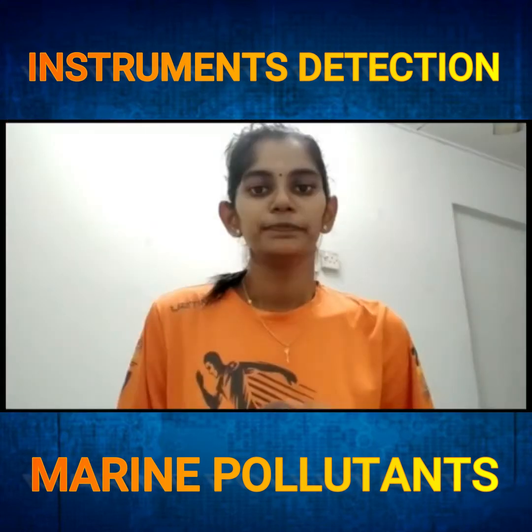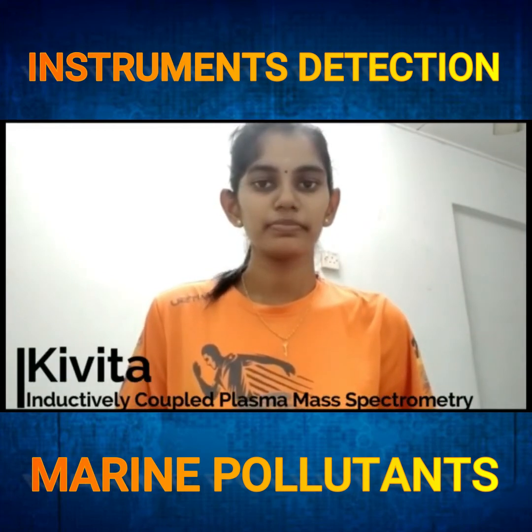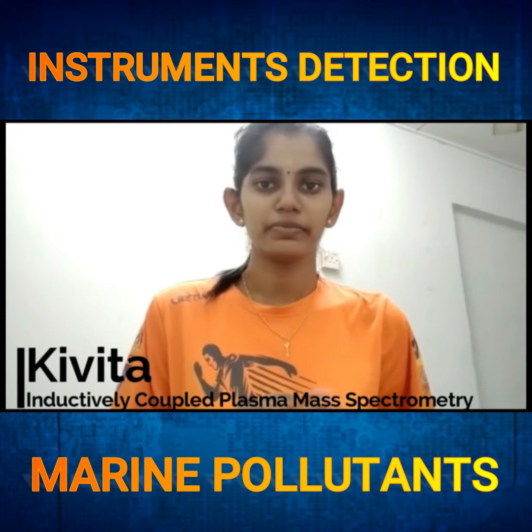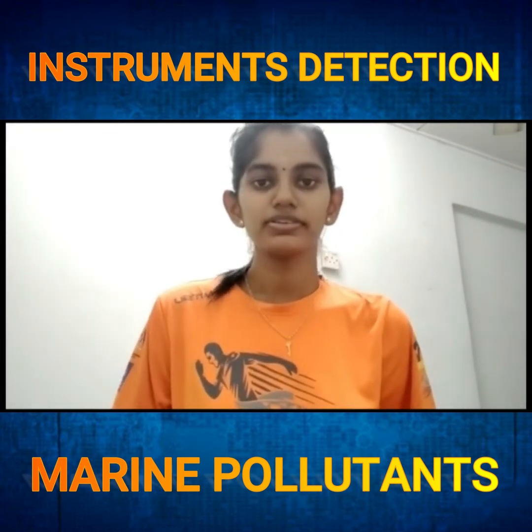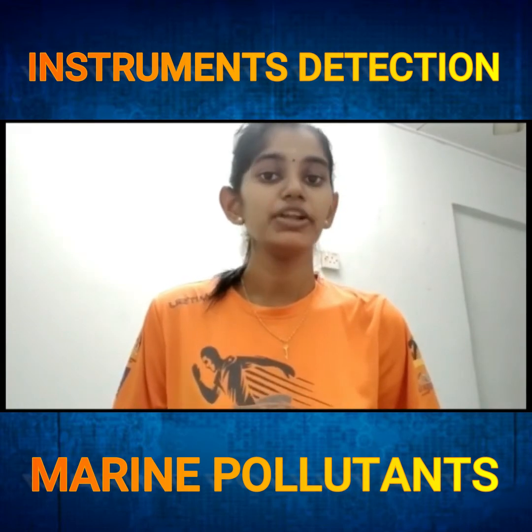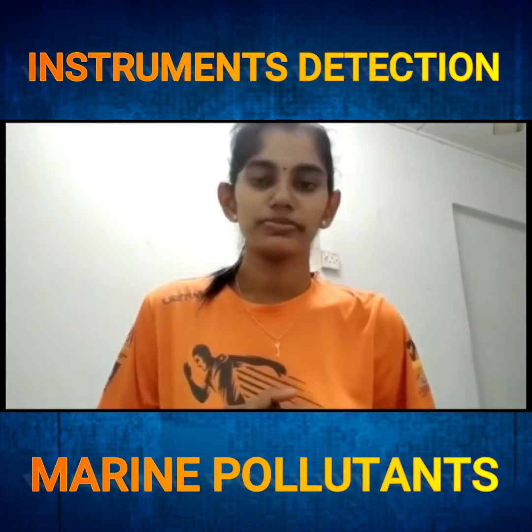That's all. Thank you. Today, I'm going to explain about the inductively coupled plasma mass spectrometry (ICP-MS), which can detect the trace elements in the marine environment at very low concentration. So, let's see how the instrument functions.